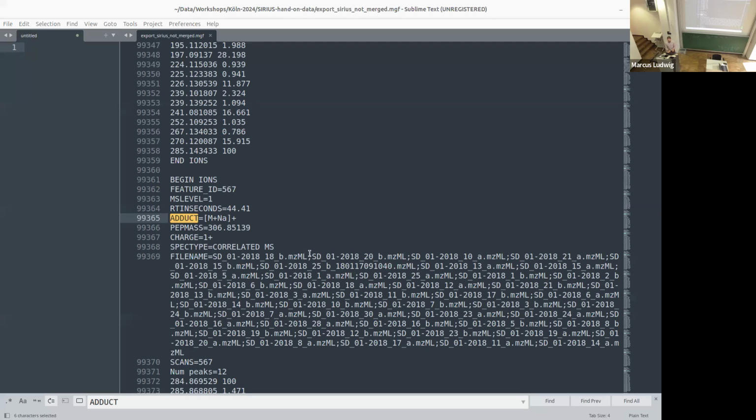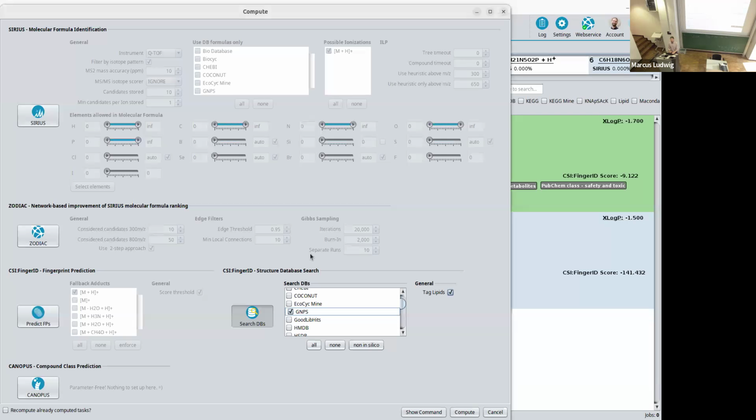So basically here we just looked at one individual compound. But now assume we want to analyze the whole data set and get some meaningful results from it without looking at all of these 5,000 compounds. So this is now the next step, where I prepared something.